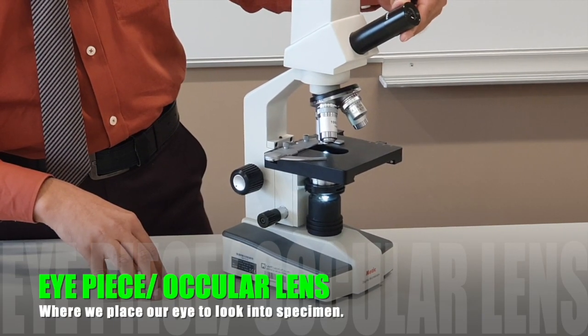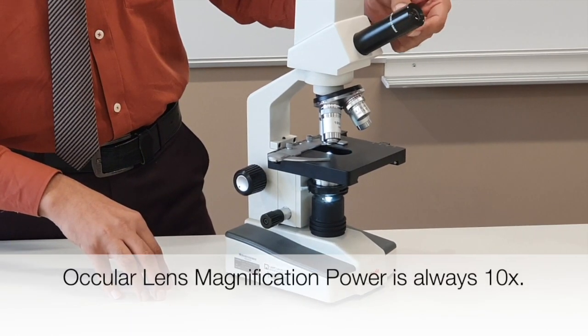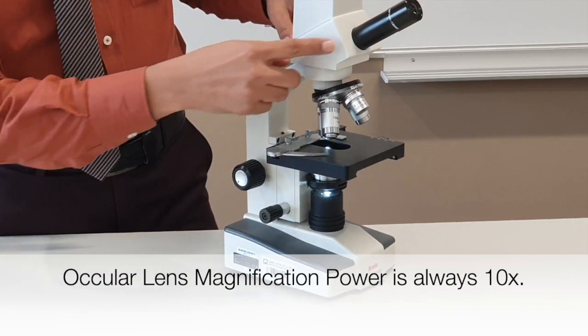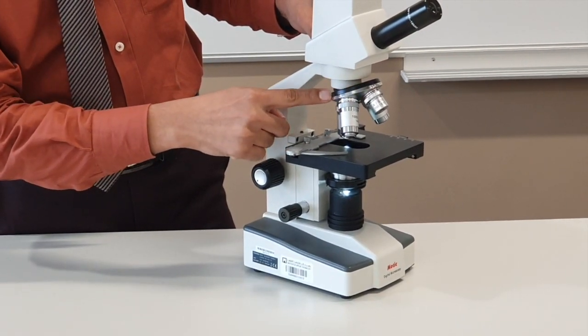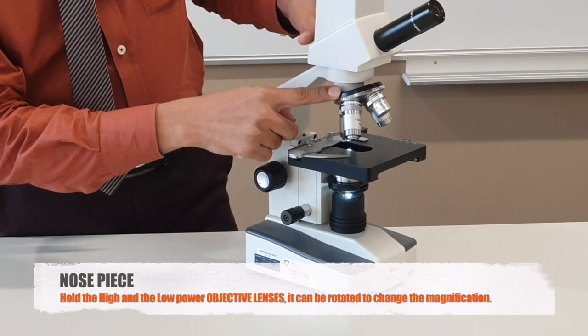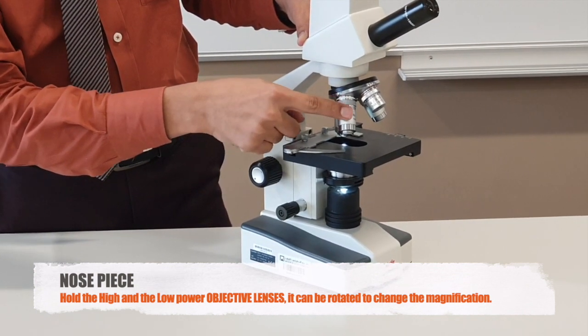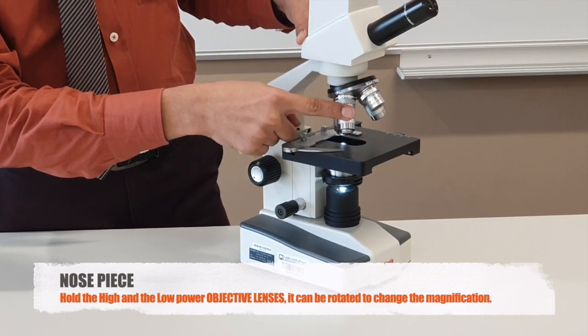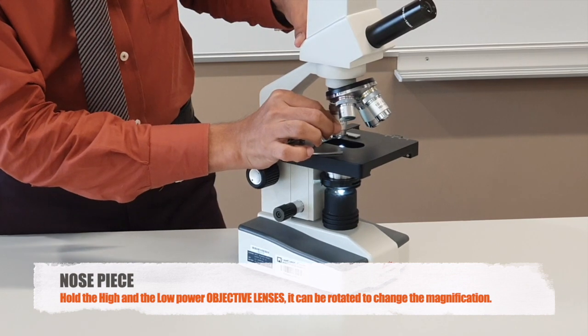The first one is the eyepiece or ocular lens. The most important thing, remember the magnification power is 10x. Then this round or circular shape is the nose piece. The nose piece is connected with two or three different lenses which are called objective lenses. The objective lenses are of high and low power.